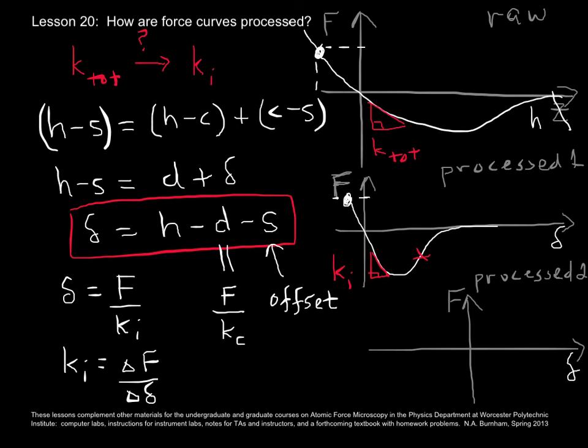And you're pretty close if you take contact as the minimum of the approach curve, just for starters, before you get into too much detail about the contact mechanics. So this becomes a curve that looks like this. Okay, so I've tried to keep the same shape as the one immediately above it, and all I've done is shifted it to the left along the x-axis, which is now the separation or penetration depth.